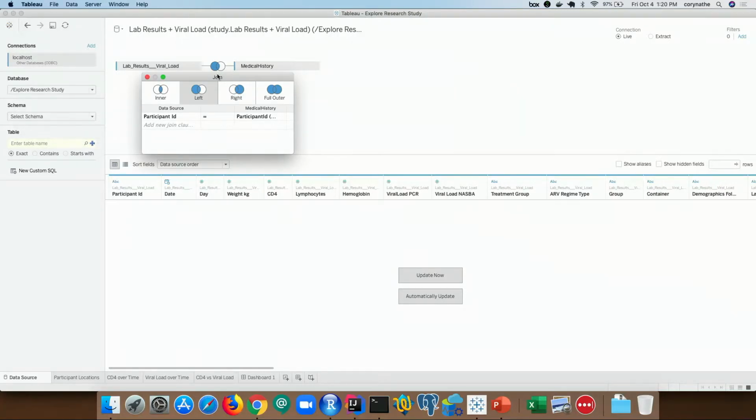Also mention that you could, if you're more familiar with the LabKey SQL side, do all of your data setup, your queries on that side, and those queries would also be exposed through the ODBC connection. So there's some flexibility there on what you're most comfortable with. Do you want to shape your data in LabKey, save those queries there, or would you rather just pull the source data to Tableau and do the manipulations on that side?